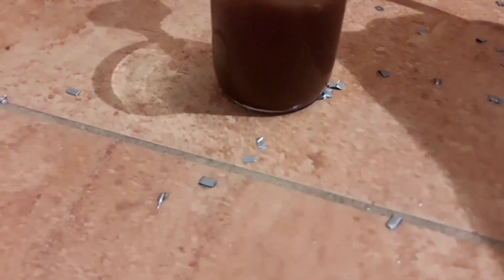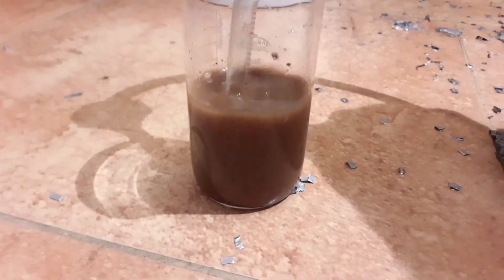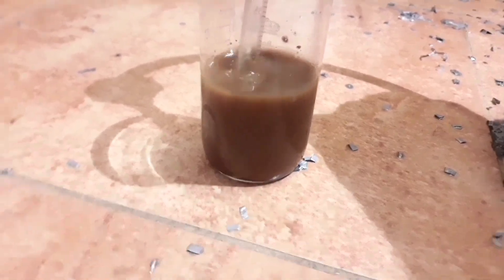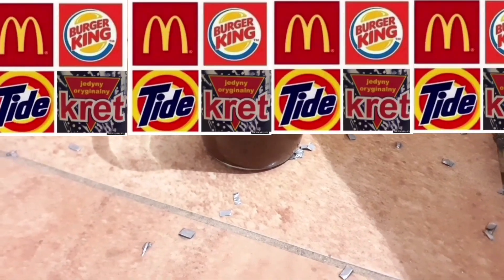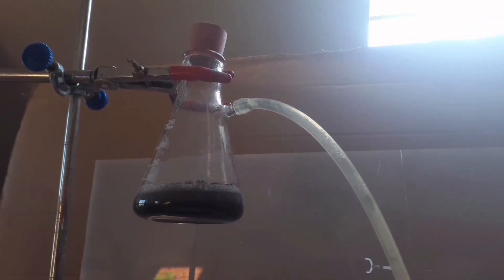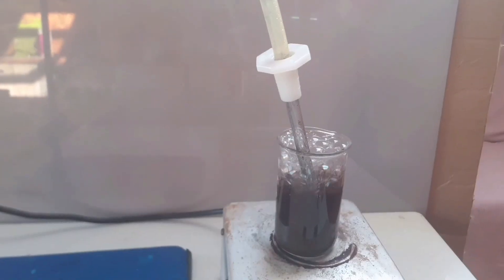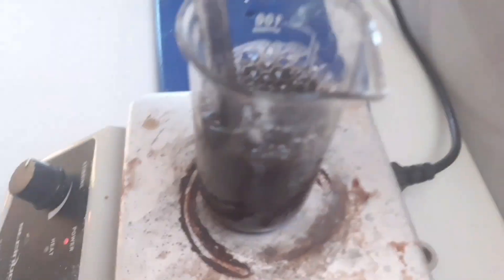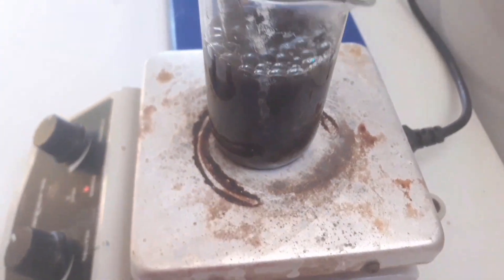Okay, somehow I managed to not kill myself, which is very good, and now we are passing the hydrogen gas through our suspension of platinum dioxide, hoping to reduce it. There is our hydrogen generator, there is a little hose running down here, where our platinum dioxide is being reduced to platinum black. As we can see, it's gone noticeably blacker, which is very good. And it seems it's almost done — now it's black as hell. Very good.